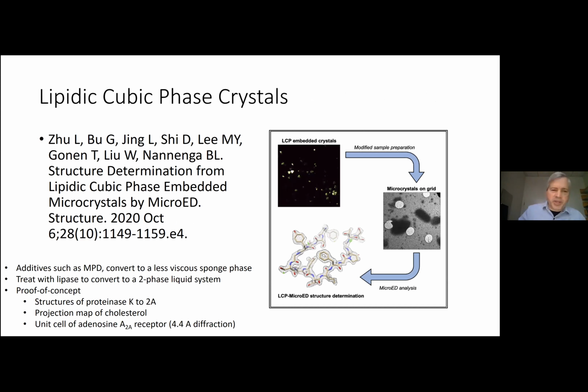There's a question about lipidic cubic phase crystals. There was a paper just this past October where they actually looked at lipidic cubic phase crystals. It was more of a proof of concept paper, but the reference is here.